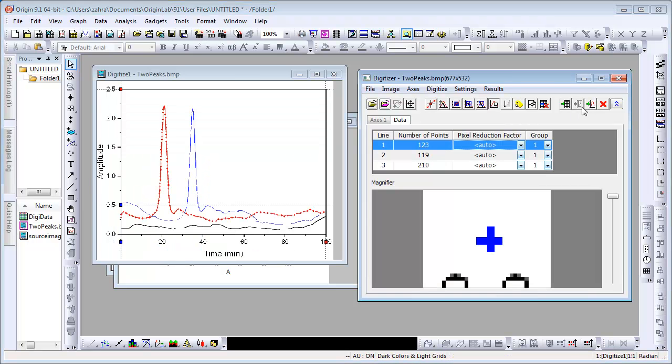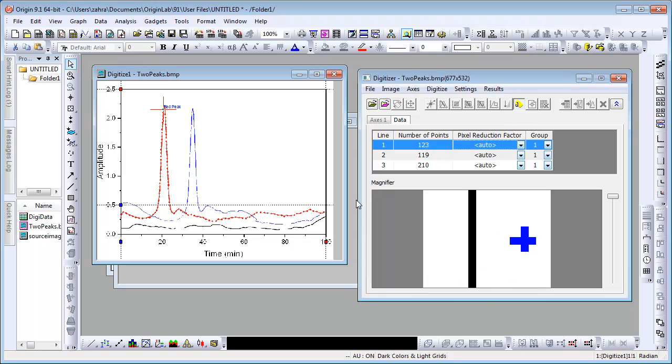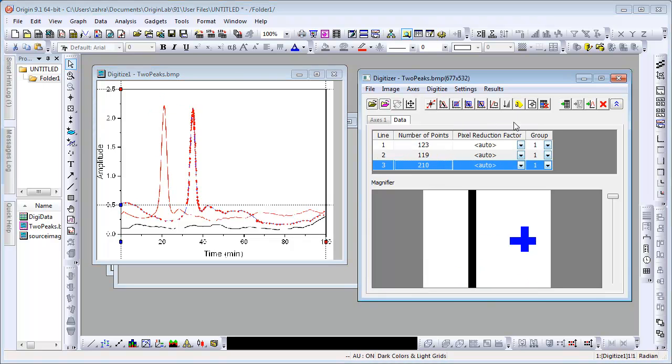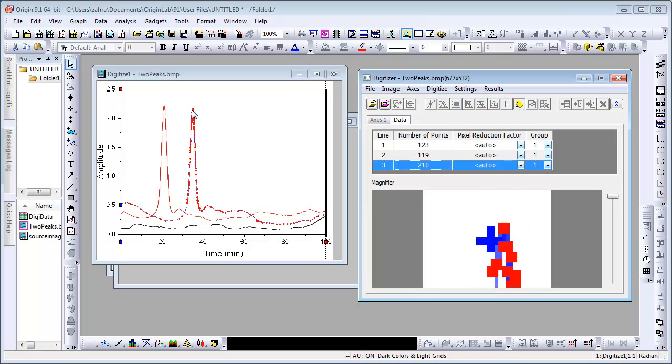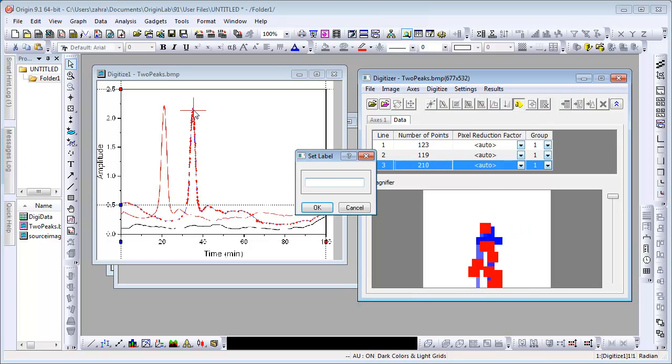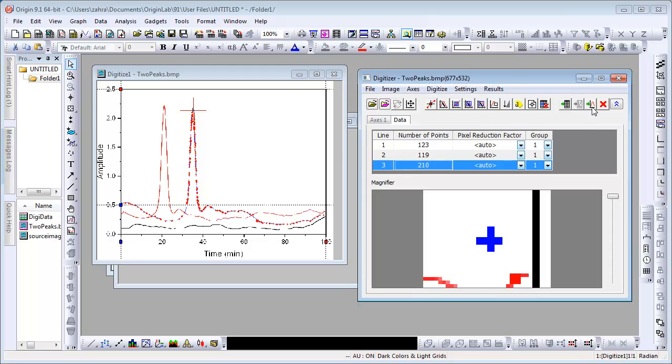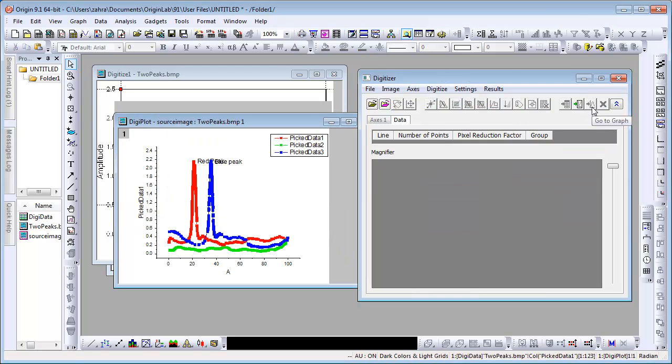We will now set a label on the red and blue curves. Click on the Set Label button and double-click on the peak point on the red curve. Set the label as Red Peak and click OK. Click to get out of the Set Label button and move to the blue curve. Repeat the same process, naming this peak the blue peak. Click OK. These changes will be reflected in both the data set and the graph.